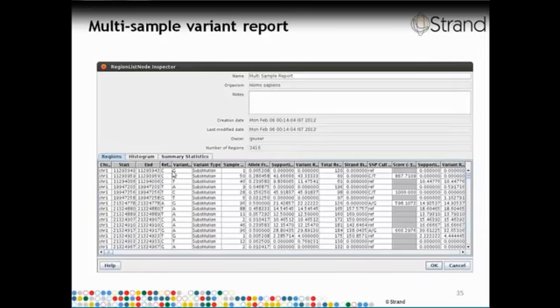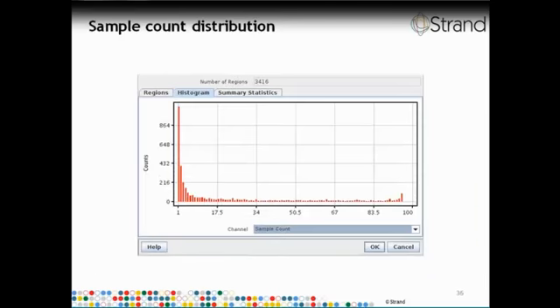After we choose the experimental setup and move on to the next page, it shows the predefined filtering use cases that are relevant for that setup. By default, the high confidence common variant alleles is the filtering use case which is shown. An allele is considered to be of reasonably high confidence if the percentage of reads which support that allele is at least 35, and an allele is considered to be common if it's present in at least half of the samples. So by default, it is set to half of the total number of samples, which is 48. So what the statement out here shows is that there are 204 alleles which have at least 35% supporting reads in at least 48 of the 96 samples. The chart which is shown out here gives guidelines on how to modify these filtering criteria.